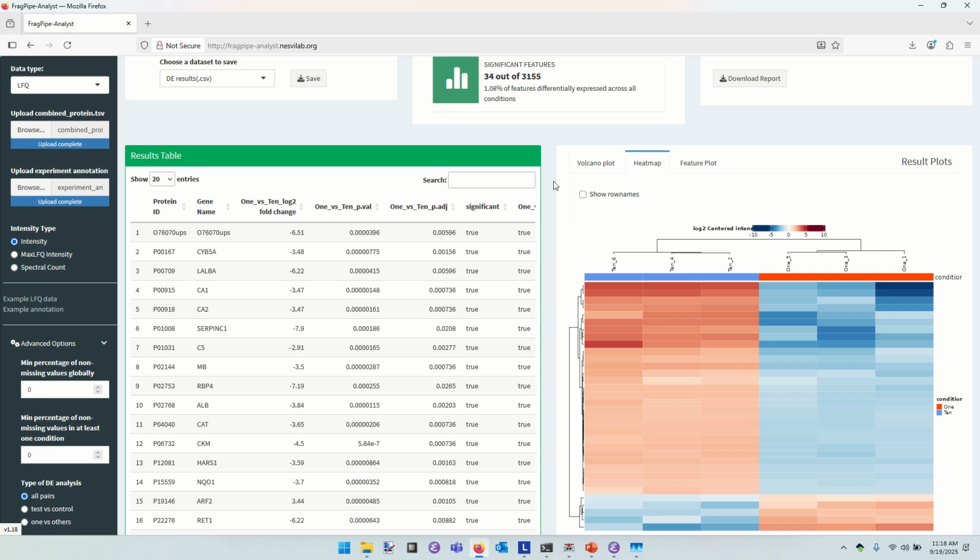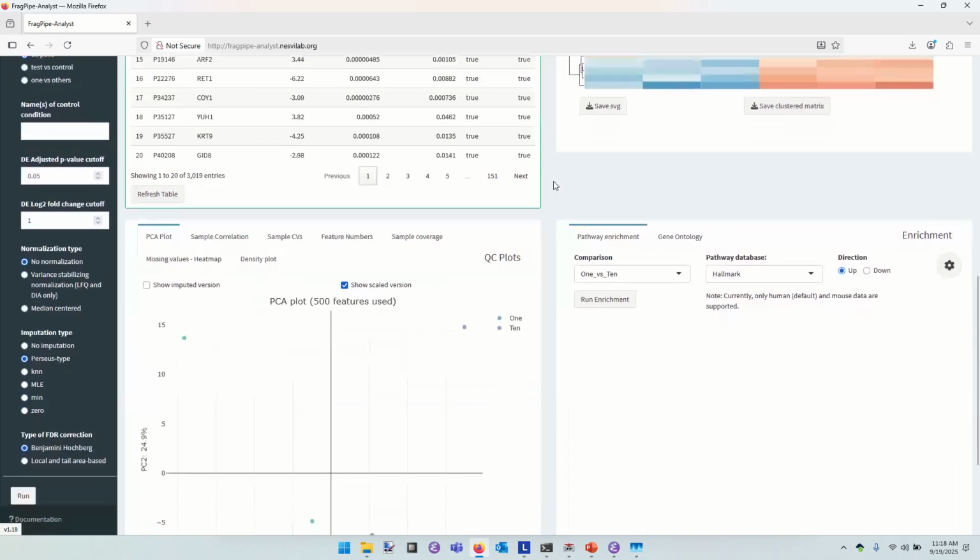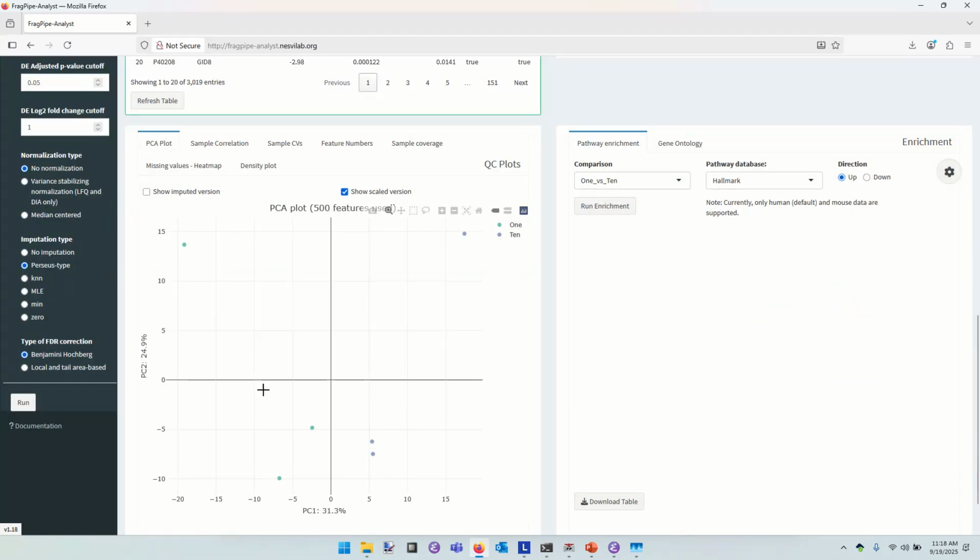I believe that's included at the bottom here. So if I roll down a bit, I get to PCAs of the samples. And in this case, I mean, they look, they're spreading all over the place. So, yeah. Sometimes you see one sample will be really out of the group. Density plots would also be useful. Yeah. Finding outliers is an interesting problem to work on, and something I would often do from just quality control data rather than identifications, but you can do them based on intensity tables too.